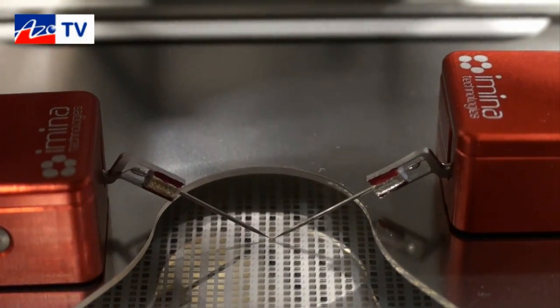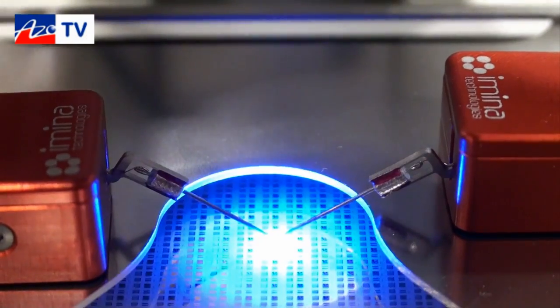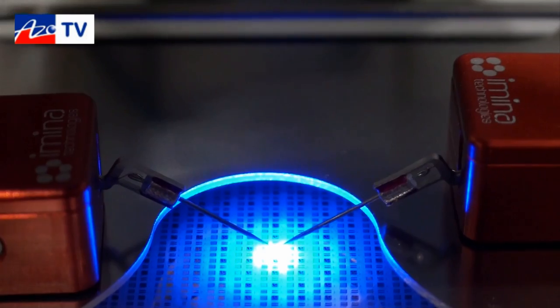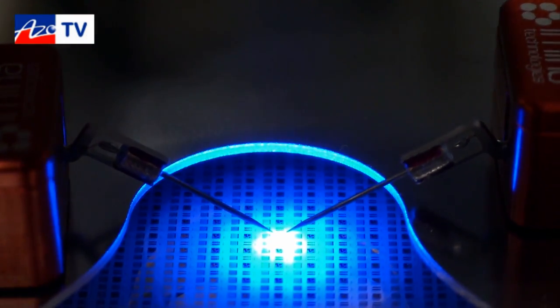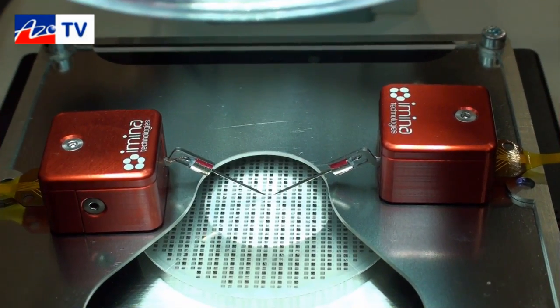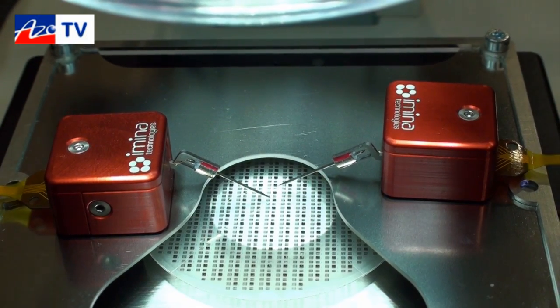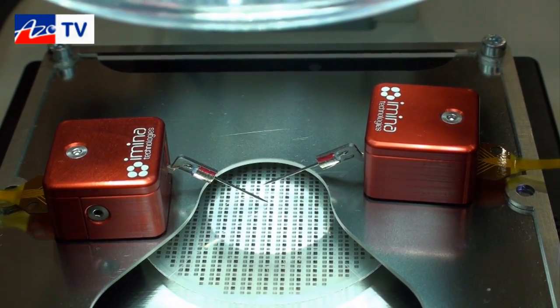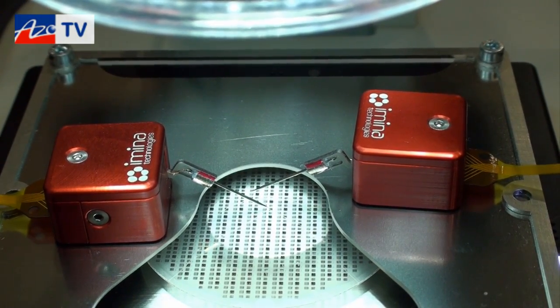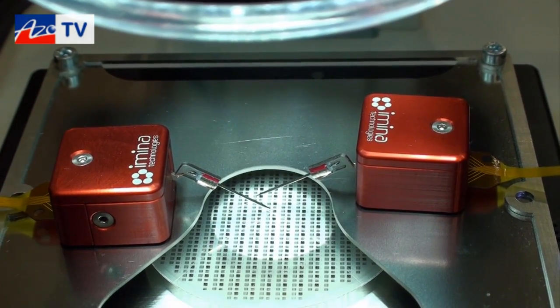So here we have two MyBot nano manipulators aligned on the LED wafer made for demonstration. Each probe is bringing current and connected to the ground, and when I put down the probe, I can actually light up the LED. It's precisely positioned on the device, making it very convenient to test different kinds of microchips. Now I will move the MyBot on the right at high speed, so you can see that we can move over a very large range of displacements across a large wafer.